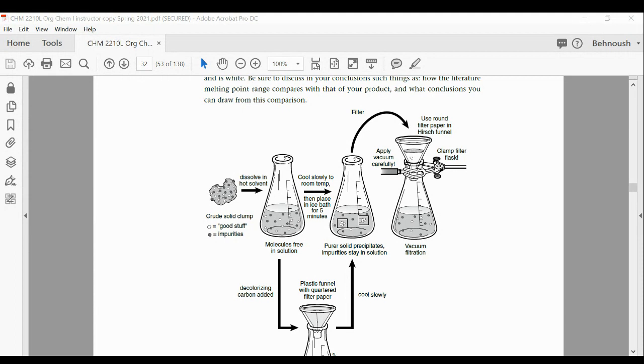You don't want to melt it. Basically, you don't want to dissolve it, right? Because with the solvent, you are going to dissolve it, not melting with the heat, but dissolving with the solvent. Okay, to prevent the solute from dissolving again.